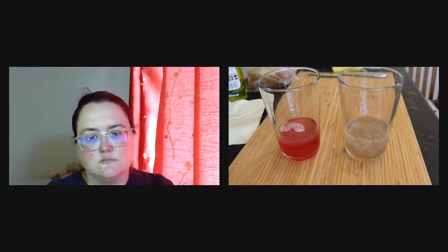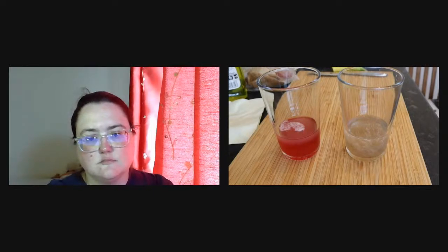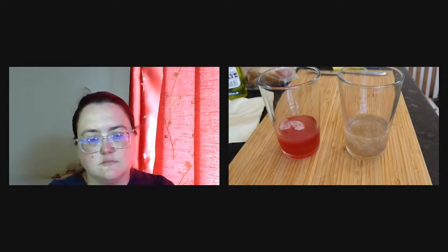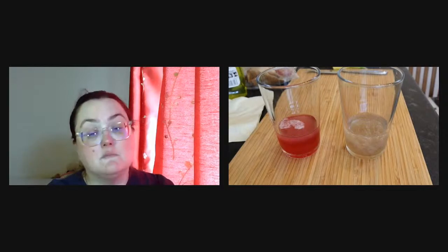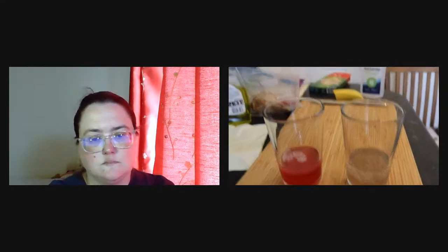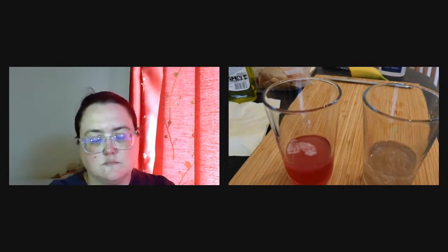So the DNA is going to start forming clumps into something that we can see. Those white precipitates are actually DNA precipitating. So the DNA that you can see is those clouds in here. This is quite a large amount that you can go and fish out with a spoon.